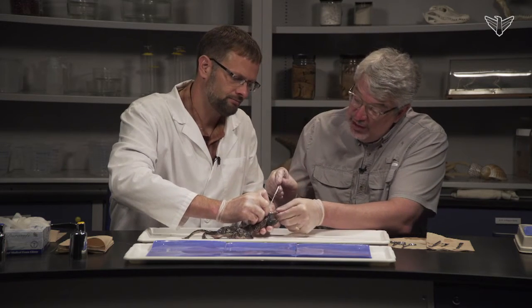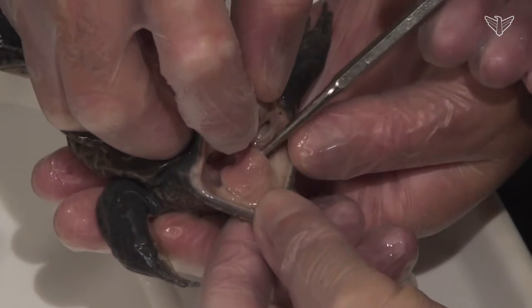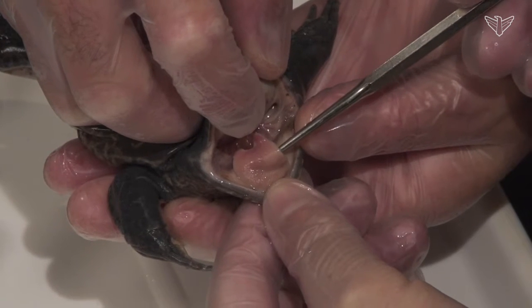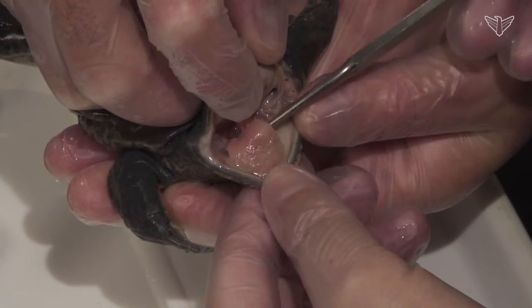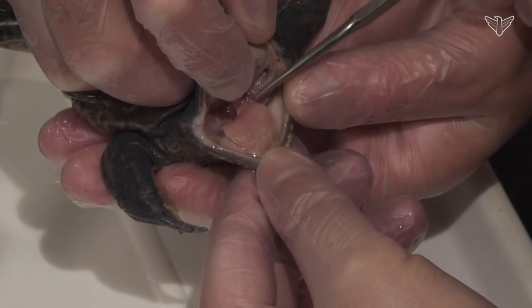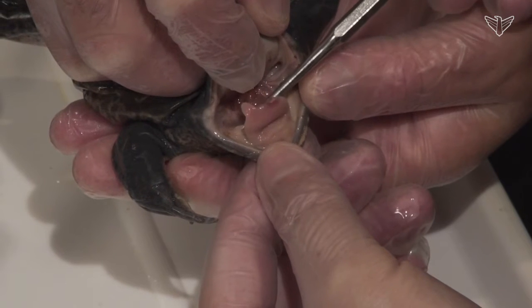Yeah, and so you can look inside, and first of all, what you really notice is this large fleshy tongue, which again is an adaptation for terrestrial animals. It's hard to catch food in terrestrial animals. You can't just have the water currents carry it into your mouth. So you need to grab it and swallow it. And so many of the tetrapods now have a tongue.